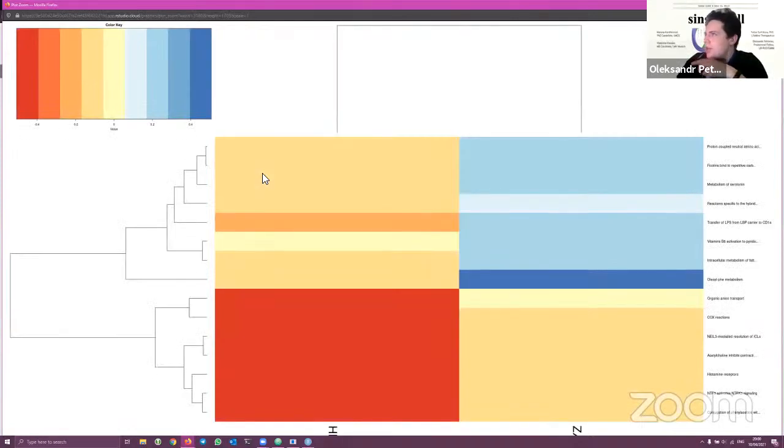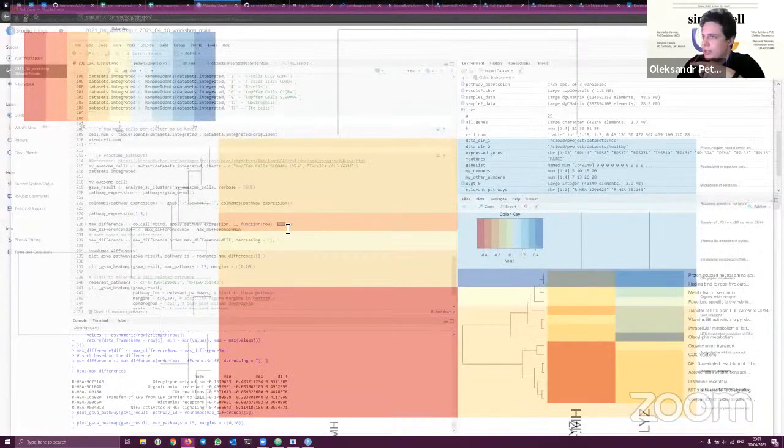And here, it's already something different. So we see the different pathways, and still somehow some of them are actually similarly expressed here. However, you see they're totally different as compared with the previous comparison of only the cancer cells. Again, the metabolism pathway is super expressed in cancer cells, as we already know from the previous analysis, and it's not exactly expressed in the T cells. Yeah. And you can play with that around again if your sample allows.